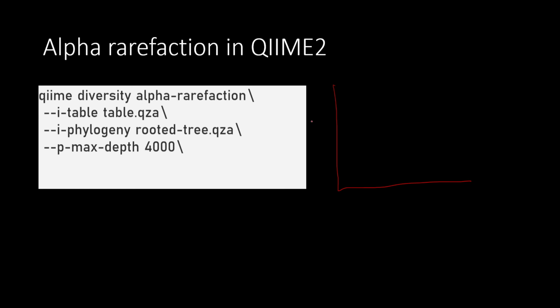We had the number of samples and the frequency, where we went up to like 18,000 on this side, and then here we've got 0, 5,000, 10,000, etc. And our histogram looked kind of like this, right? We had a lot in this area, it dropped down, and then there was some here.